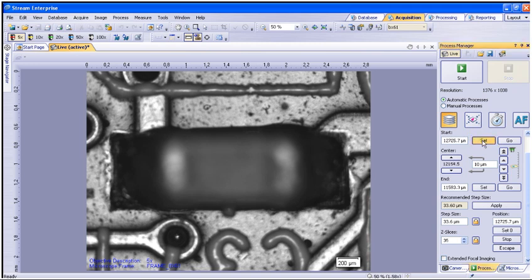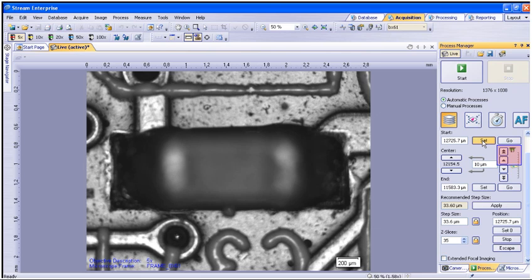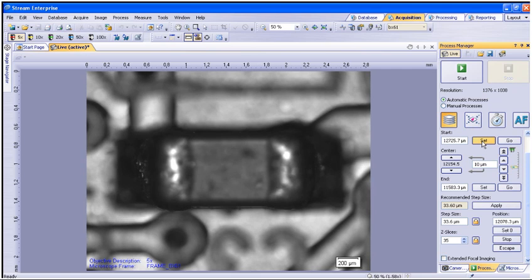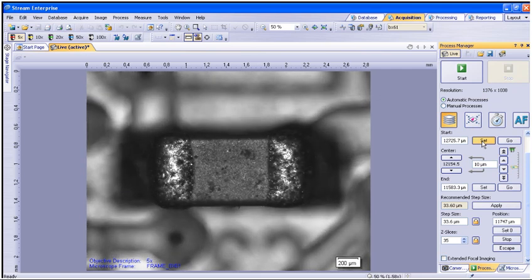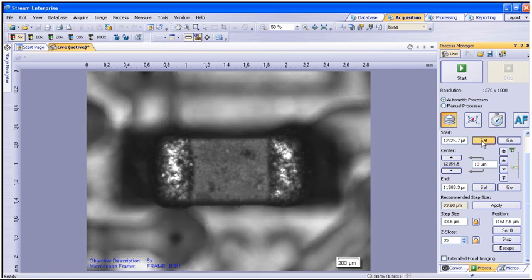You will now need to drive focus to the top level of the focus range or the highest point of your sample. This can be done using the up arrow buttons within the process manager or by using the hardware control focus knob on the microscope frame. Once this point has been reached, you must set the end point.